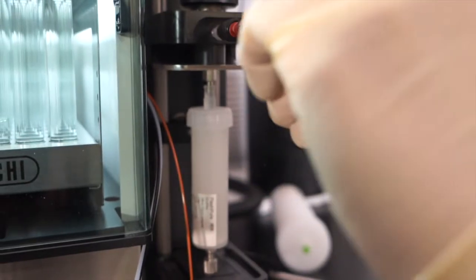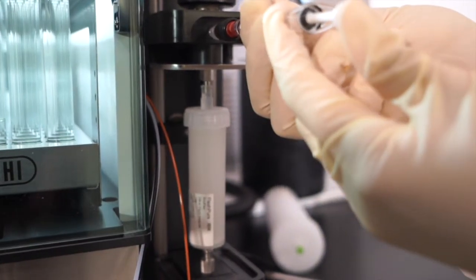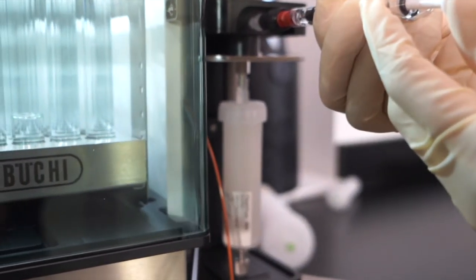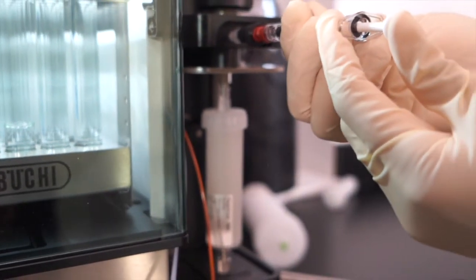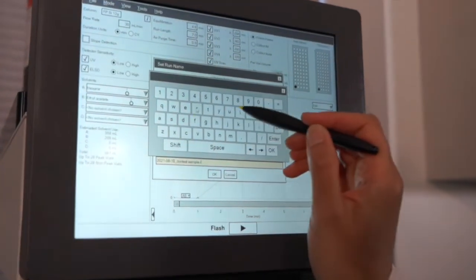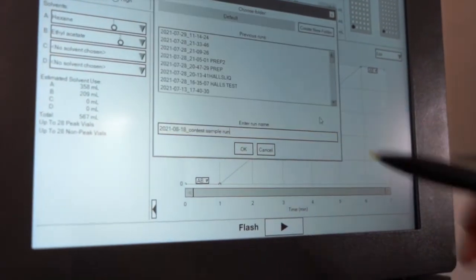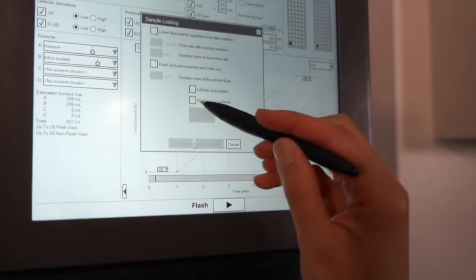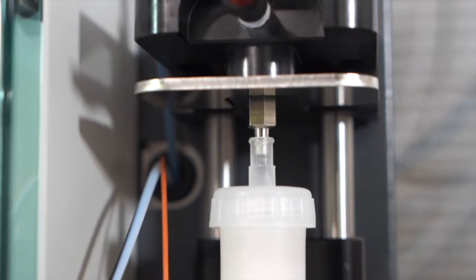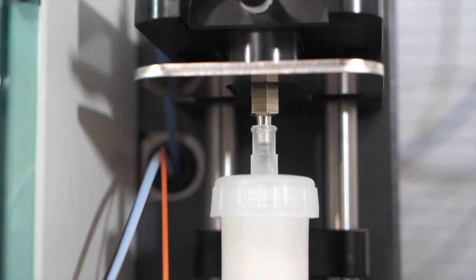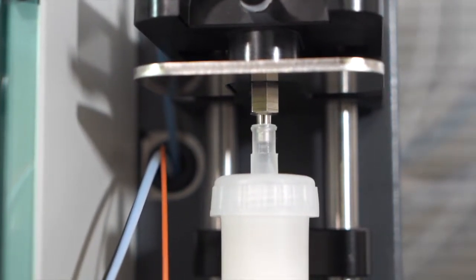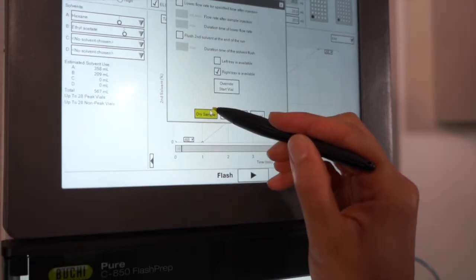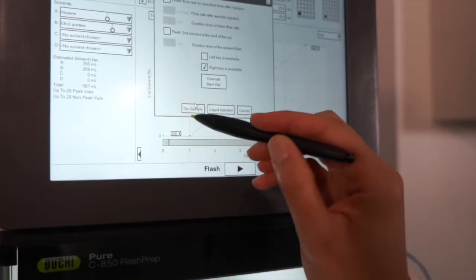There are two different ways to introduce sample to the system, liquid injection or solid loading. After entering the gradient and pressing play, the system will prompt you to name your sample and select the type of sample loading. Then the system prompts to prime lines. If the solvent lines have been primed recently, you can skip ahead to column equilibration. Now that the column is equilibrated, the system says it's time to load my sample and press play.